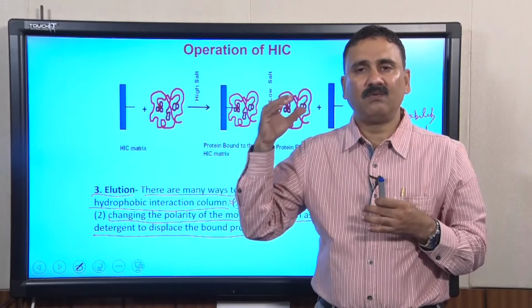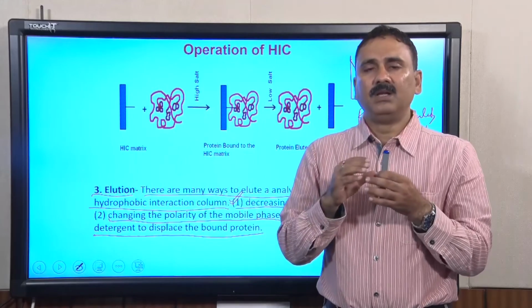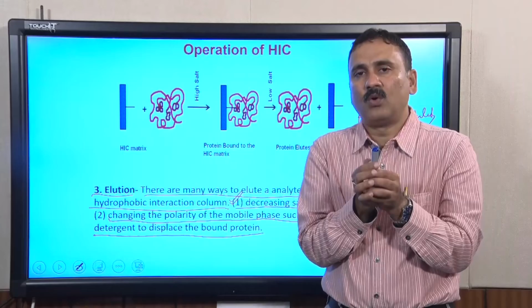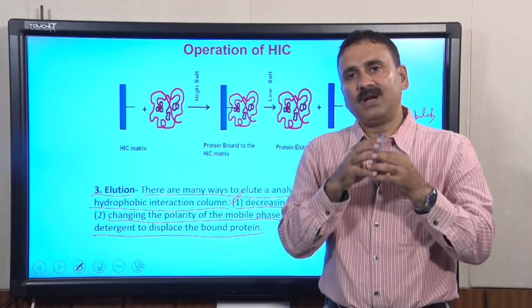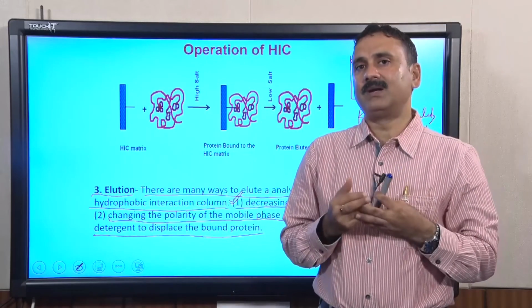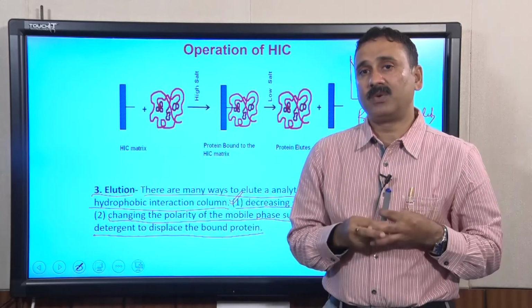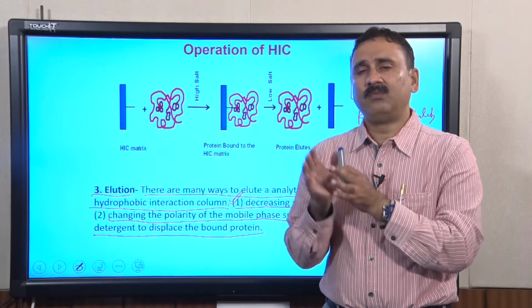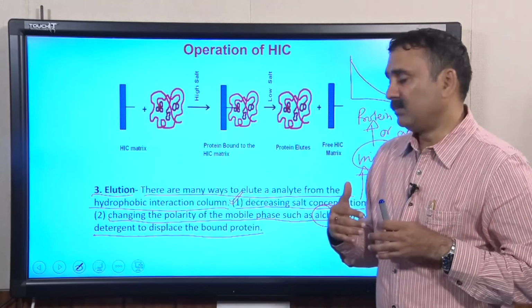to sustain such harsh hydrophobic solvents, because once you put the hydrophobic solvents, you are going to destroy the structure of the protein. The hydrophobic core present in the center of the protein will try to come out, and in that process the three-dimensional arrangement of the protein is going to be completely altered. So, that is why it is advisable, before you start an HIC operation, to briefly test the affinity of the protein in a smaller volume, so that you will know that the protein is going to be eluted from the beads.